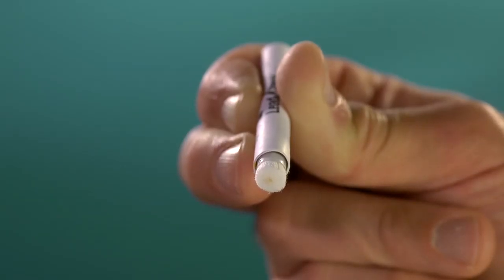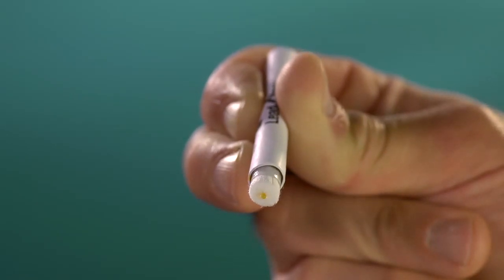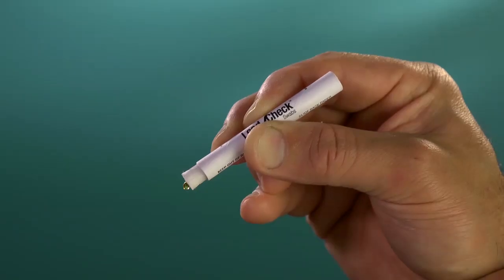Squeeze the tube until you see a bit of the reagent liquid soaking down through the fibers of the swab and appearing at the end of the swab tip.